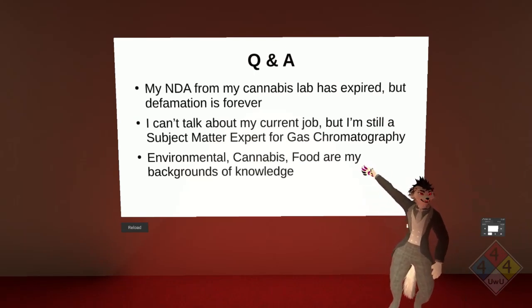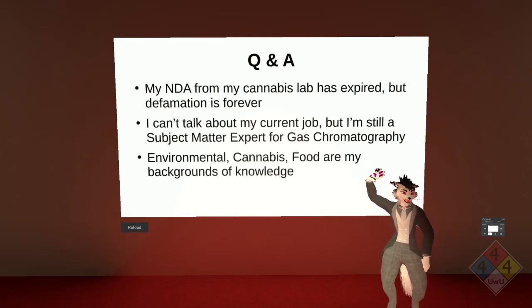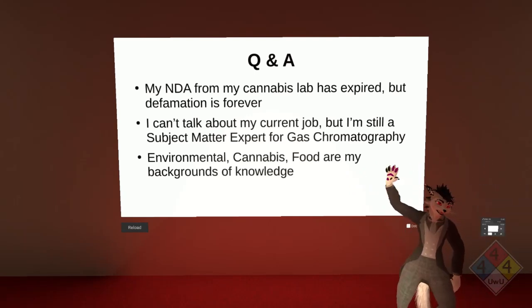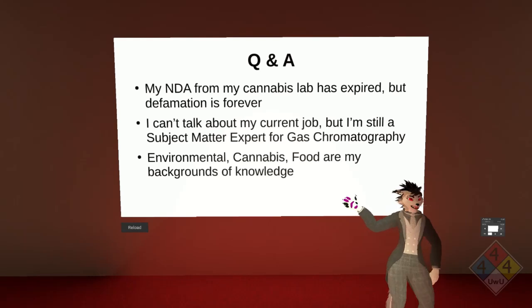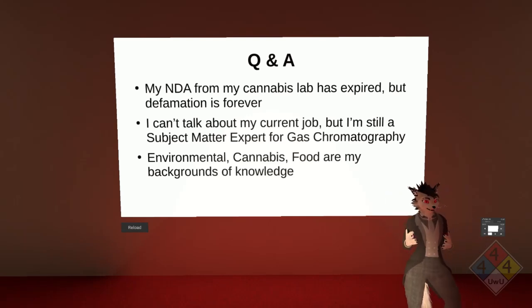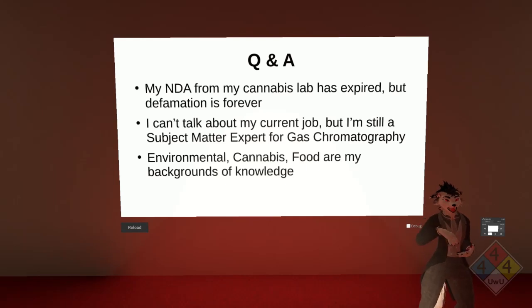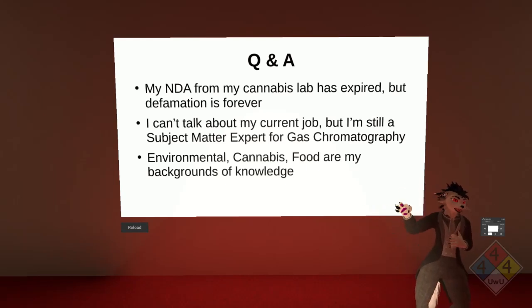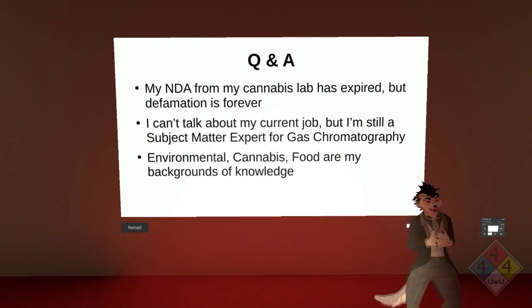Now, my NDAs and my time in the cannabis lab are done with, but I need to be careful of any sort of defamation or whatever. My current job I'm not willing to talk about, unfortunately, because I still have NDAs there, but I am a subject matter expert in gas chromatography with my background being largely environmental and cannabis, but I've also been doing a bunch of things like alcohol, plastics, petroleum, beer, so I'm more broad in application now. I have experiences in all parts of the cannabis lab, though: LC, HPLC, Microbial, the ISO 17025, doing the validations, dealing with auditors. Great times.